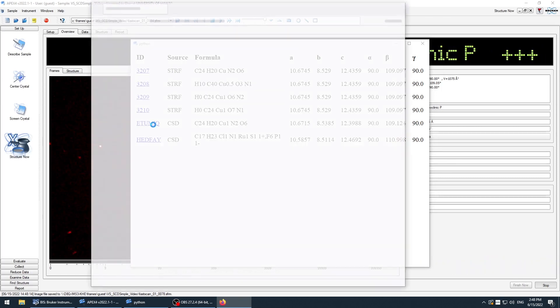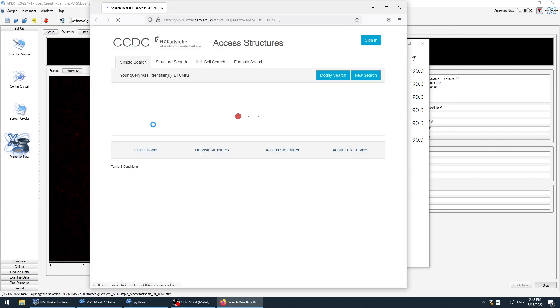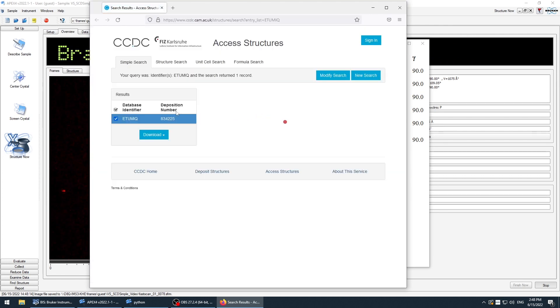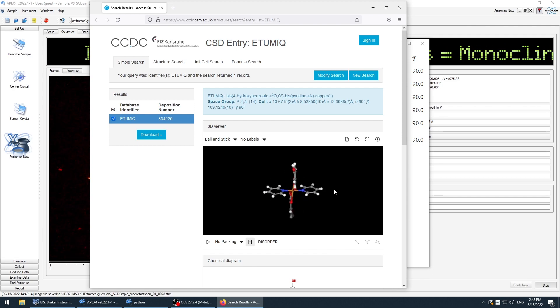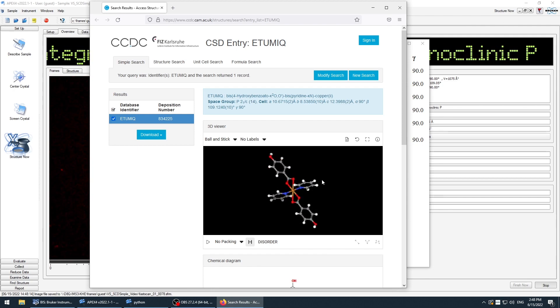You just click the link, the web interface opens, and you can check whether this structure is already known or not.